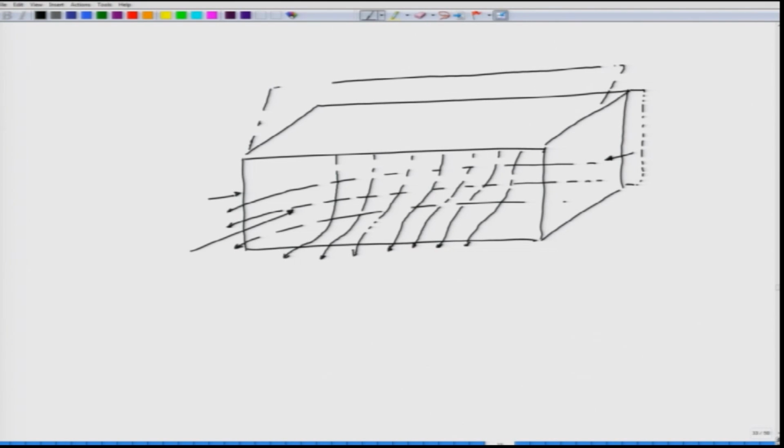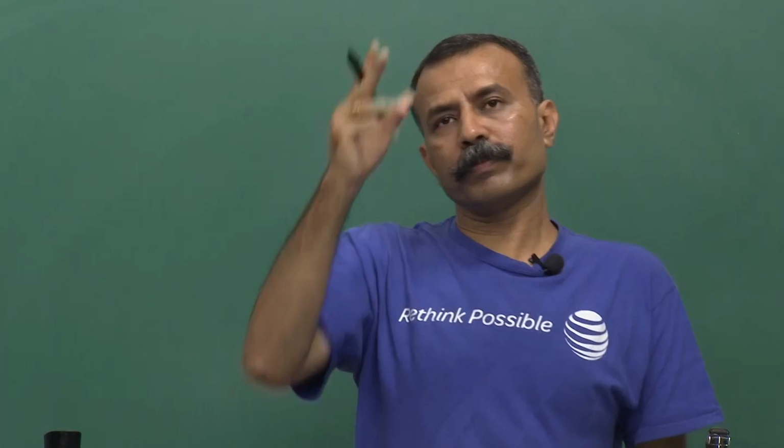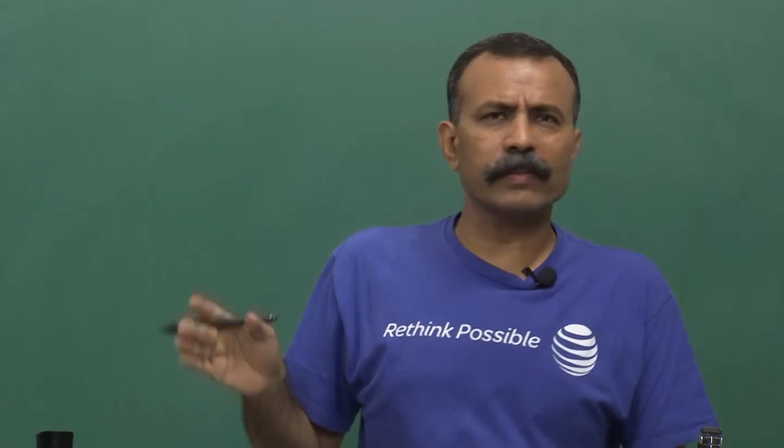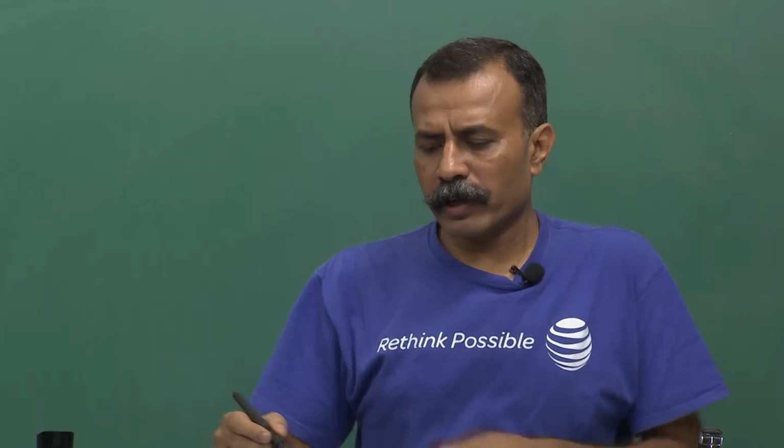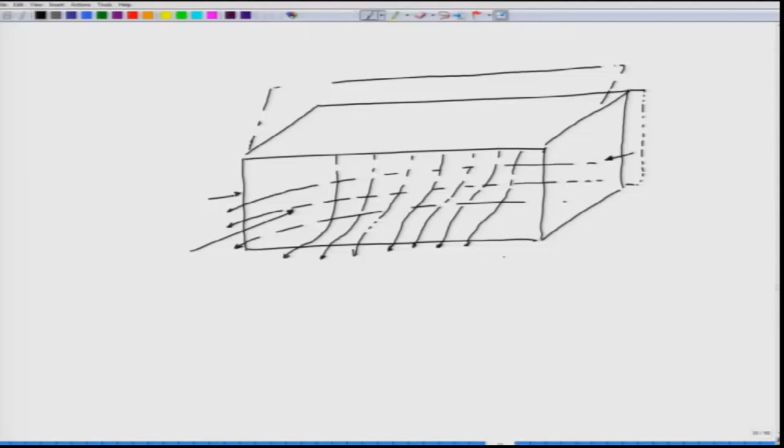Automatically, to make the air flow, you will have fans either rotating from the top or from the side, and there are several permutation combinations. So, you could have either a vertical laminar flow or a horizontal laminar flow hood.